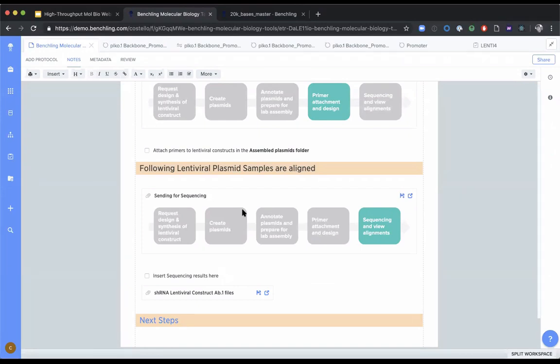I was able to promote those fragments to the registry, where I could capture critical metadata against them, seamlessly attach sequencing primers that I had designed in the past to the vector that I've created, design new primers in bulk against a particular sequence, bring my AB1 files in and create an alignment without ever having to leave the Benchling platform, and do it, quite frankly, very quickly, right?